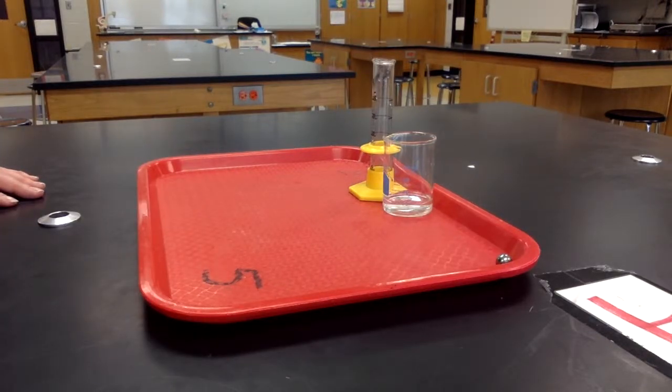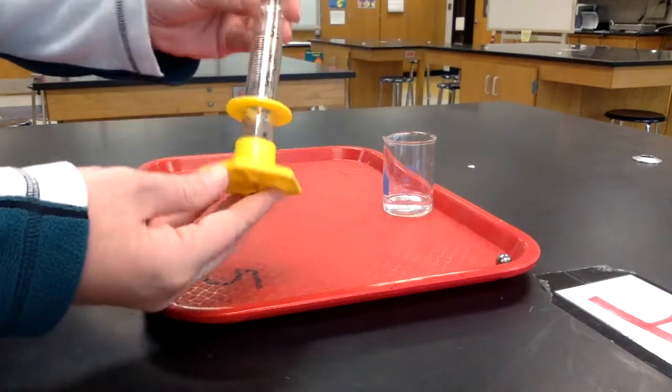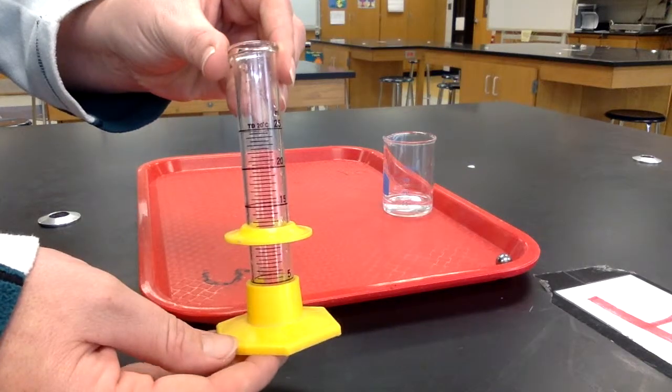This video will help you with measuring volume. To measure the volume of a liquid you are using a tool called a graduated cylinder.